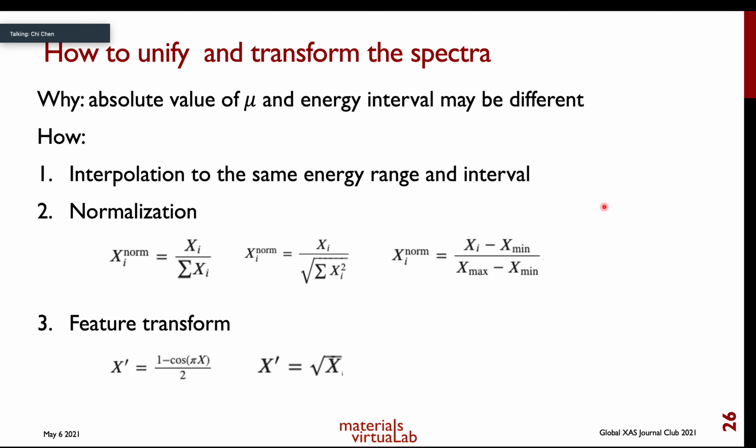the data. So this was carried out because when you do a mathematical transformation to the data, you will likely emphasize some features over the others, and different functions will emphasize different regions of the data. So we want to use this transformation to bring more variety to the data set.